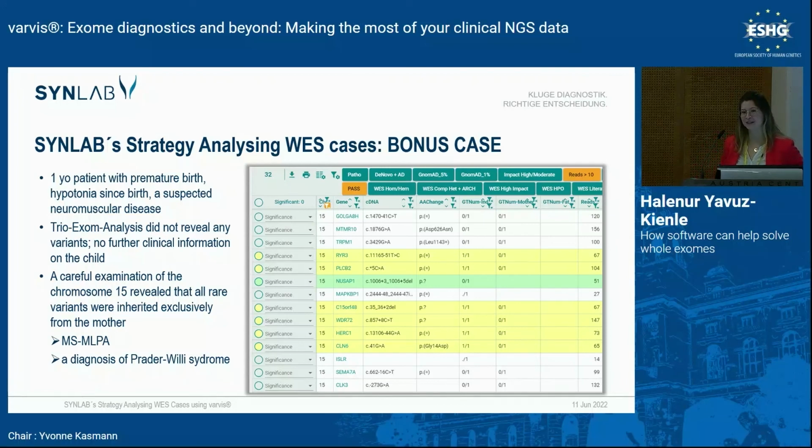Using Varvis, even though you don't follow the strategies that are there for you, you can also identify such interesting patterns using the exome sequencing data.